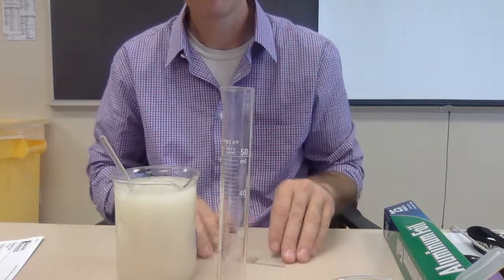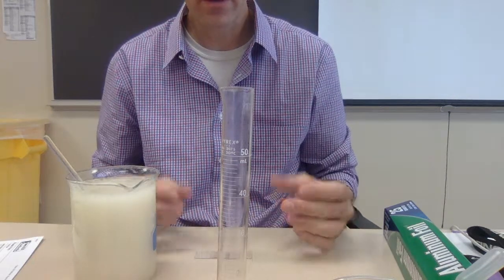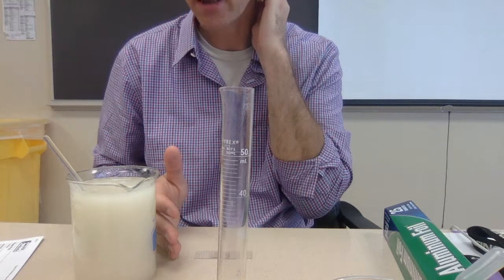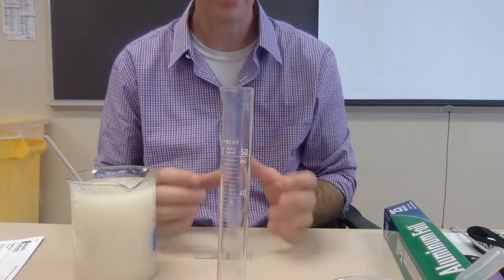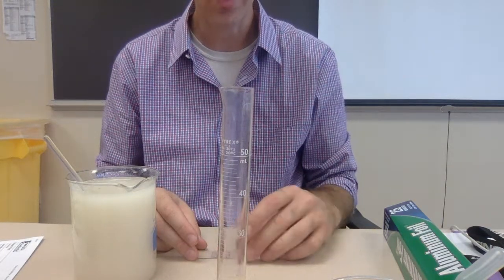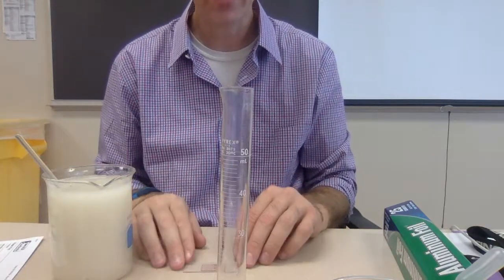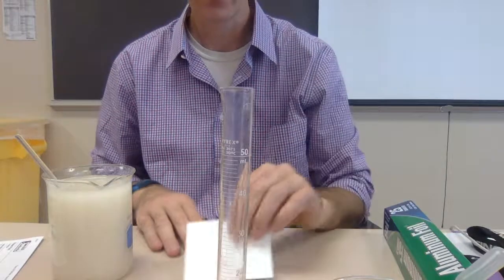Okay. Now, then you're going to put it under the microscope and start under medium power, the yellow, and then eventually you'll need to get to the high power, the longest lens, to measure them. Otherwise, they're going to be too small to count. Okay, and it says in your instructions to make 5 different counts. Okay, so what does that mean?